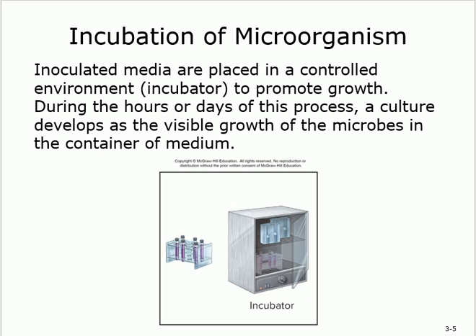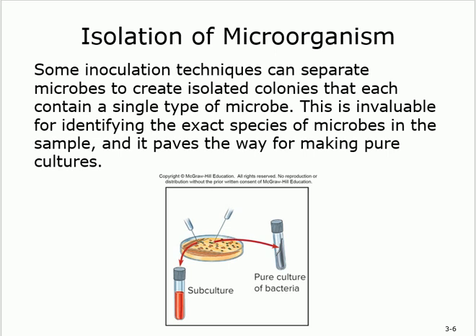I did the incubation. So the most important thing to remember about incubation is controlled temperature and nutrient factors. This is the most important thing. The incubator is to allow the growth of the organism, with growth factors and controlled temperature. This is what we need to understand here about incubation.